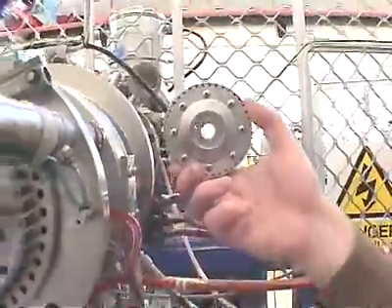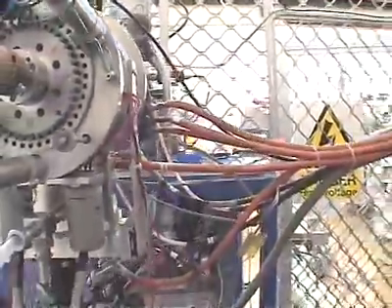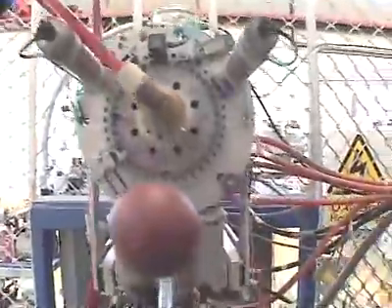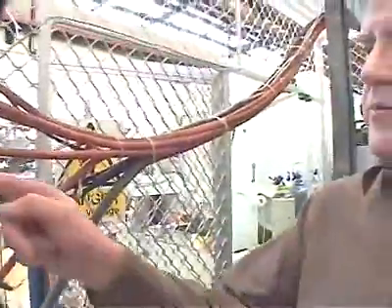The purpose of the ion source is to pull the carbon atoms out of the graphite and fire them down the tube towards the accelerator like bullets out of a gun. In order to get them moving fast enough to get to the accelerator, we put a very high voltage onto this ion source, 50,000 volts. That's why the source is enclosed by a cage. There are doors which we lock when we're running so that nobody can get in here and injure themselves.